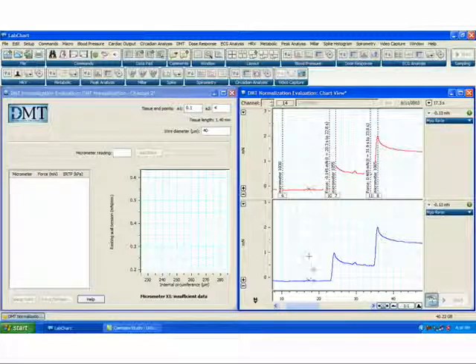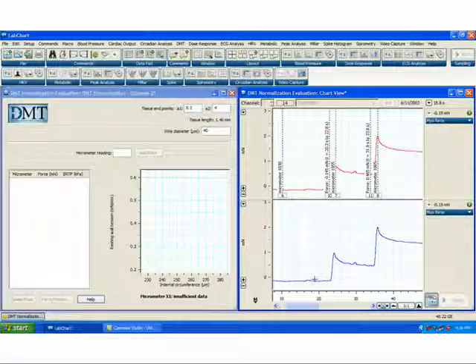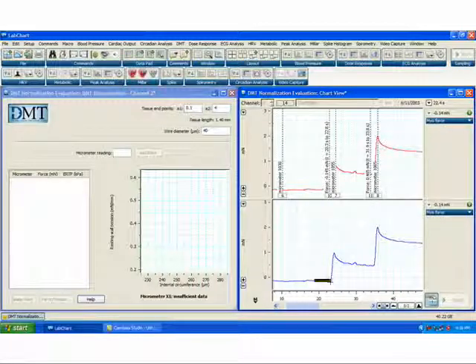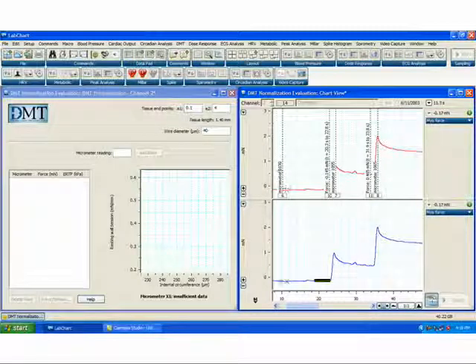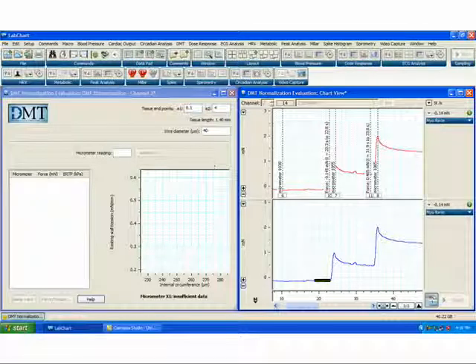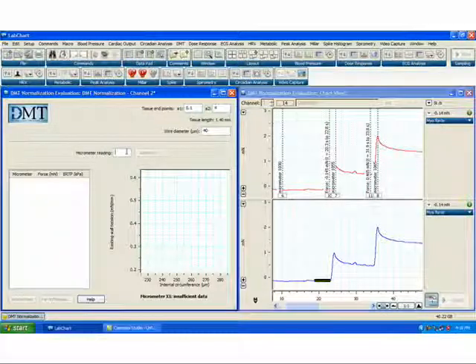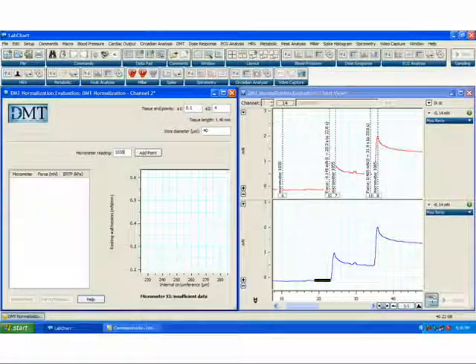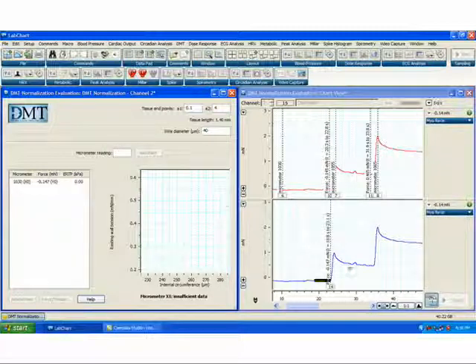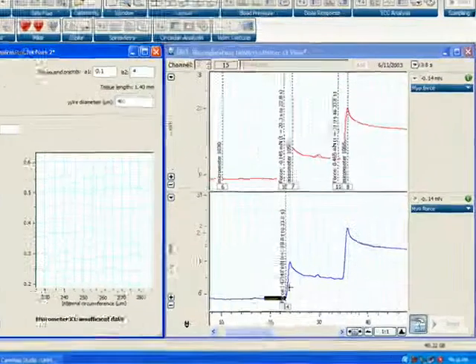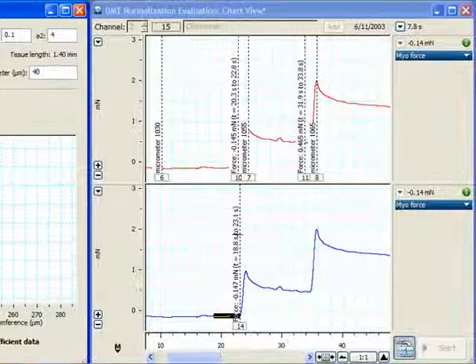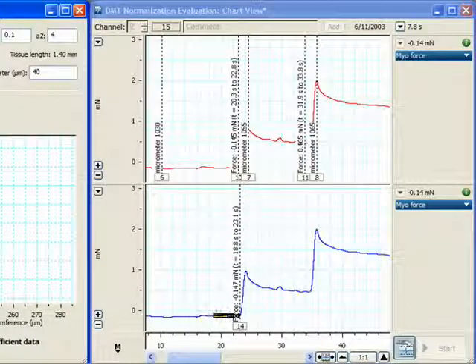Using the DMT normalization module is relatively simple. You select a region of data once the tissue is stabilized, and you enter the micrometer reading. Here the micrometer reading says 1030. After entering the micrometer reading, you click Add Point, and then proceed to the next step. Notice that when I entered Add Point, it dropped in the force calculation for the highlighted region of data.